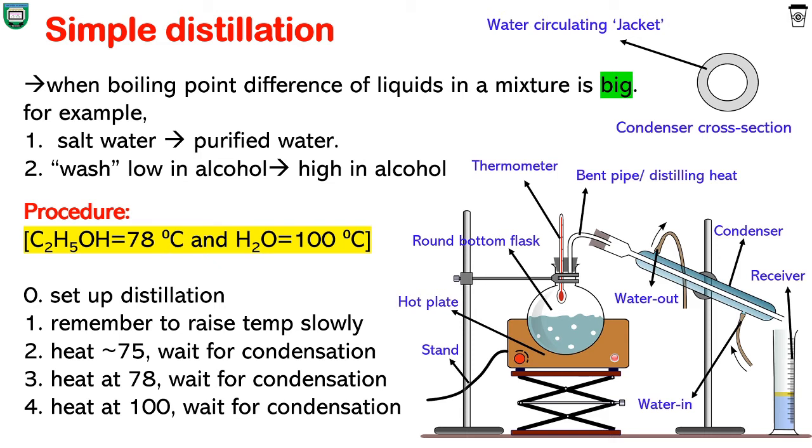Later replace the flask and label it as ethanol. Now we have extracted all or most of the ethanol. Only water is left in the RB flask. Now heat to 100°C to collect water into another receiver and label it as water. Anything that has left behind in the RB flask is just impurity.